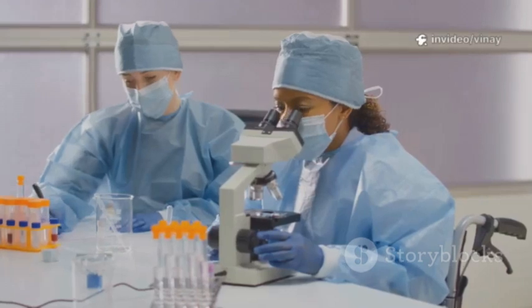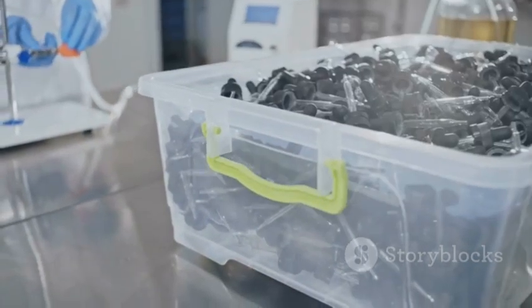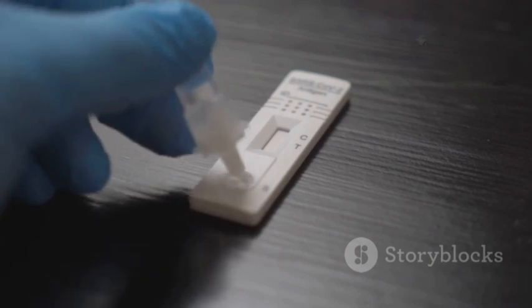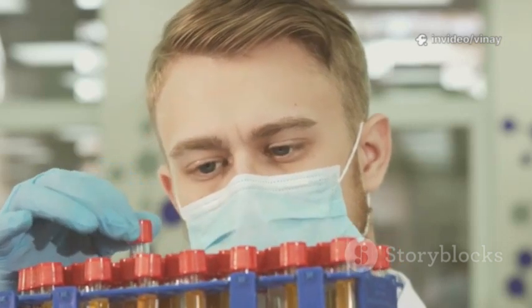The validation of these sterilization cycles is a rigorous data-driven exercise. It involves placing biological indicators, which are standardized preparations of highly resistant bacterial spores, like Geobacillus stearothermophilus, in the hardest-to-reach locations within the equipment. After the cycle, these indicators are tested for growth.